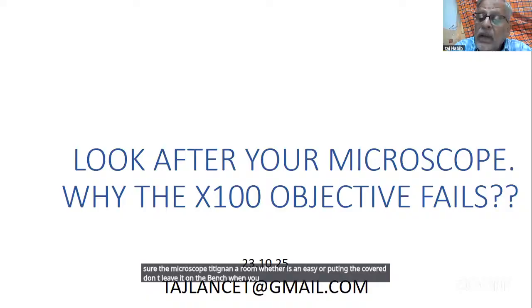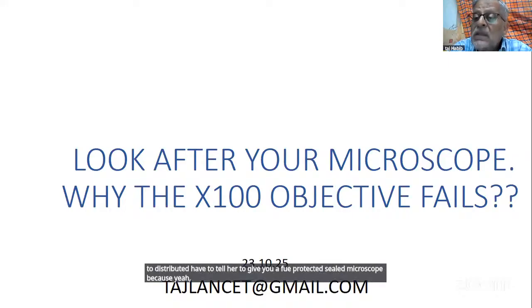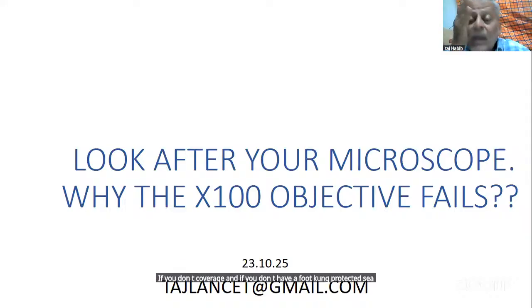When you're ordering a microscope, request the distributor to give you a fungal protected sealed microscope, because in places like Mombasa and Kisumu, if you don't cover it and don't have a fungal protected sealed microscope, it won't last a year.